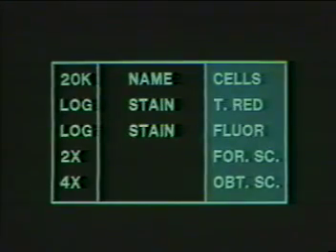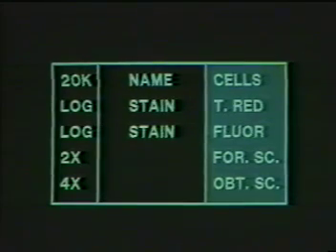As you may recall, each collection label is divided into three columns. The leftmost column indicates how many cell data points will be collected and to which level each FACS channel is adjusted. The center column lists the cells and reagents that were marked for pipetting into the sample. The right-hand column lists the cell and sensor subheadings of the protocol. This column cannot be edited. If a sample label is inaccurate, it should be corrected before you collect data.